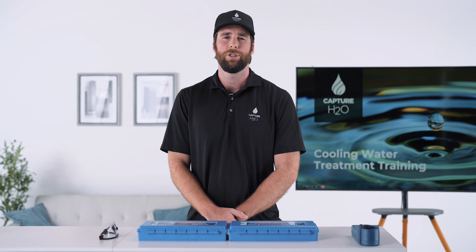On occasion, you will run into an instance where we are not able to see a color change in the hardness indicator powder. If this takes place, you're going to need to dilute the sample.